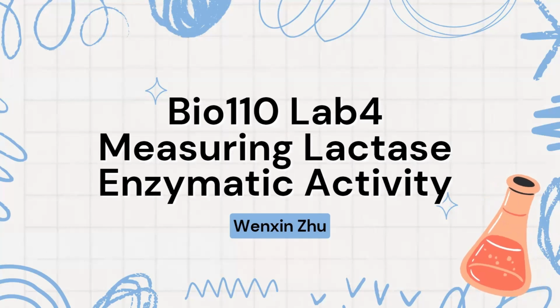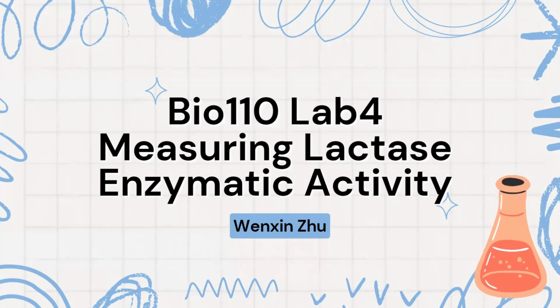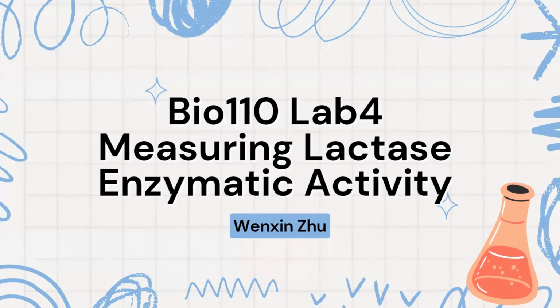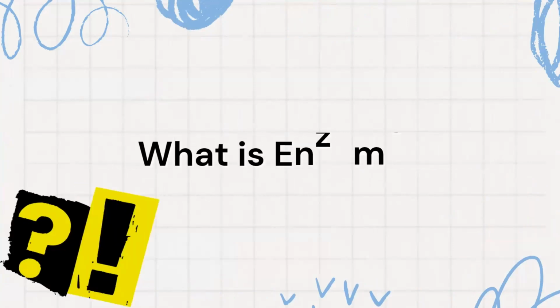Enzymes play an important role in human life. This video will learn more about enzymes by focusing on how to measure lactase activity and about lactose intolerance. First, I will give some background information ahead. So first, what is an enzyme?